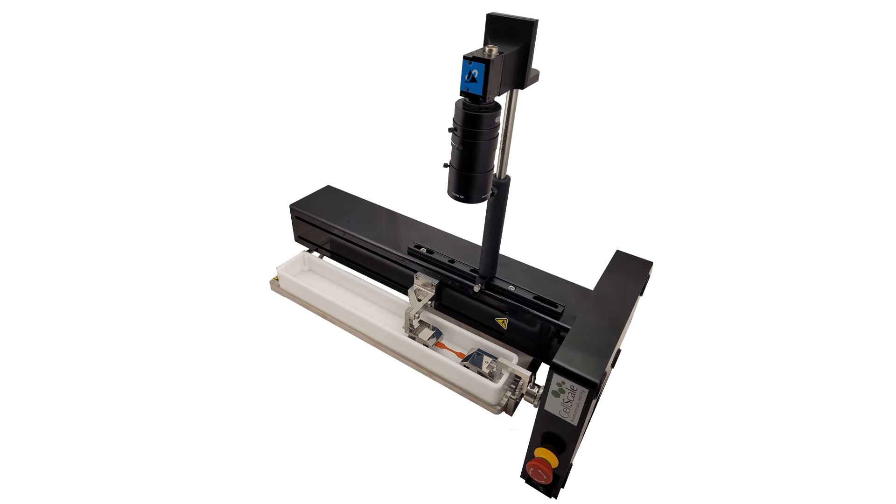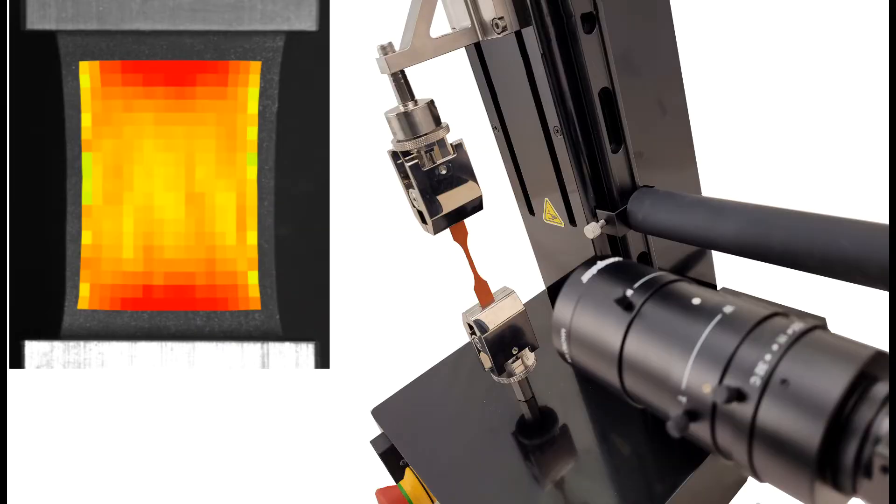The UniVert comes standard with a webcam for visual feedback to the user but the system can also be upgraded with the scientific imaging system. This allows not only for image capture but also post-test analysis of the specimen strain using digital image correlation techniques.